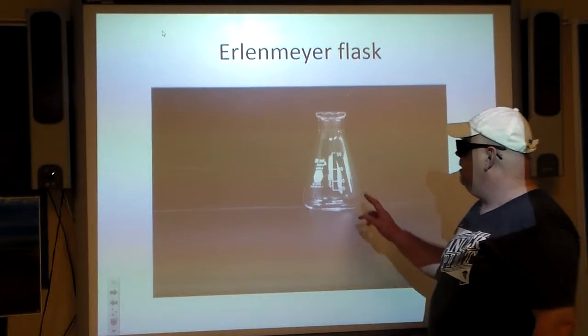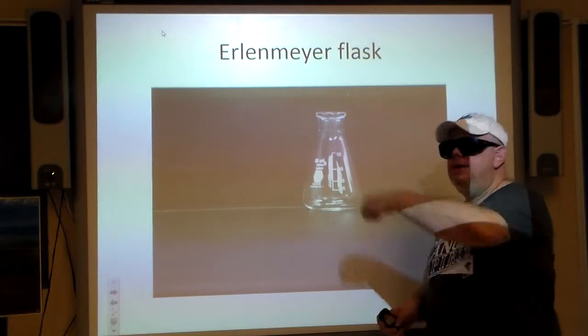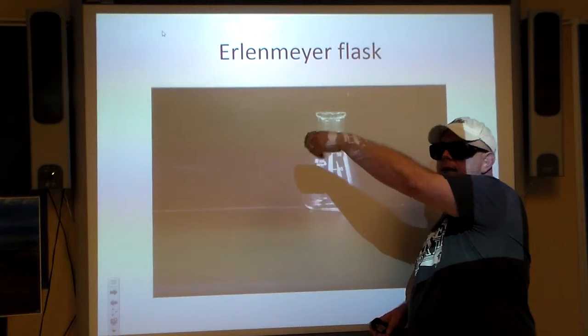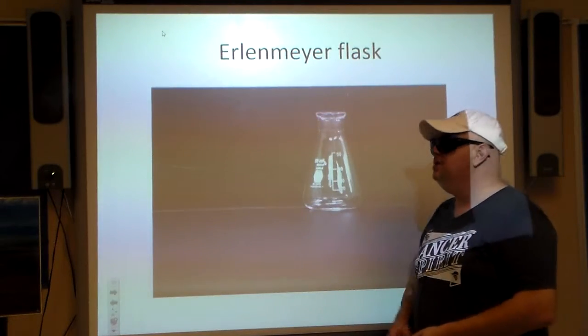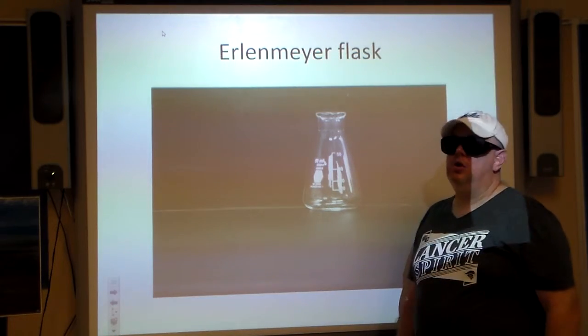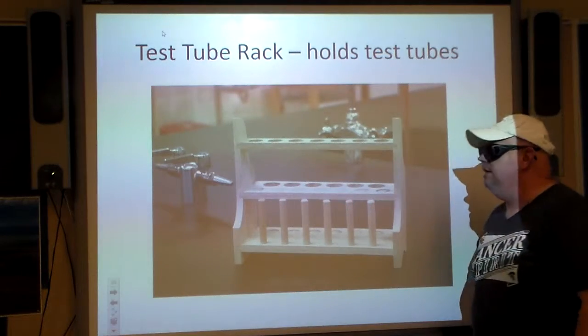Erlenmeyer flask — another stereotype piece of glassware you'd find in the lab. You may notice it's shaped this way — it makes it easy to grab by the neck and swirl it around. That's basically it. It's used for mixing things, and it's pretty convenient and handy. You guys will have a chance to work with this.